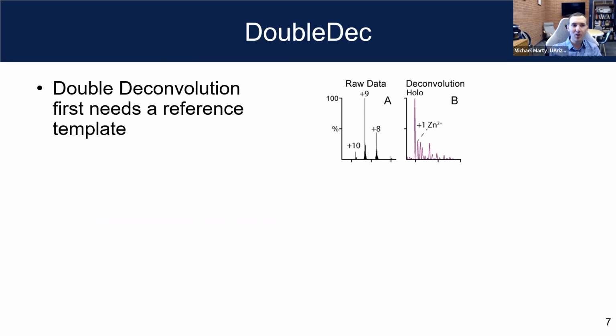Basically, the problem was we were doing these experiments, and I think this would be potentially useful for what you all are working on. We have an experiment with a complex natural protein, bovine rhodopsin. It has a series of glycoforms and different post-translational modifications in addition to the glycoforms. We wanted to look at zinc binding. This is the holo peak, this is the zinc bound, but these are all different glycoforms, and they also have different zinc bound states.